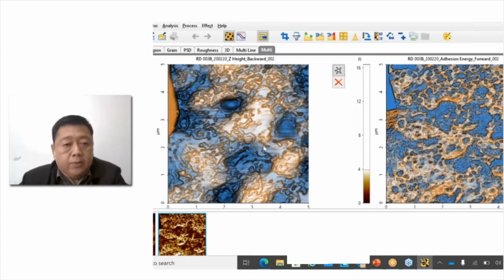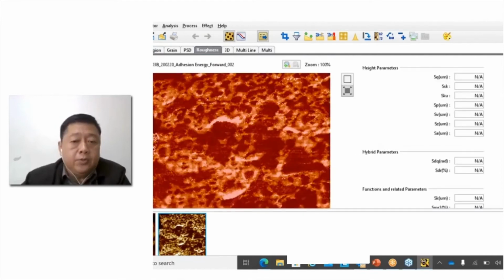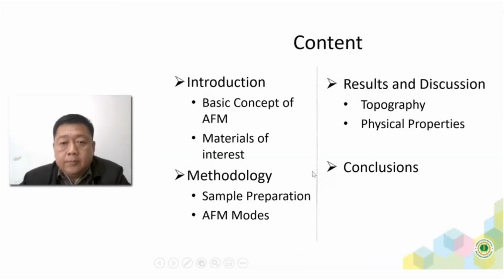In this case, on the left, the blue is natural rubber, and on the right, the blues are the coating material. It's very clear, and you can see where your coating material is and how well it covers the surface, and the distribution of the coating material, whether good or not. There is a lot of information you can get. You can even calculate the roughness here, but we don't do that. Let's go back to the presentation, where we were just now.